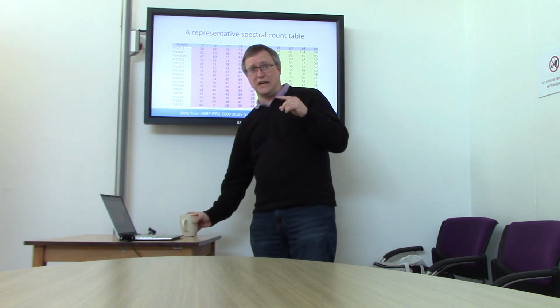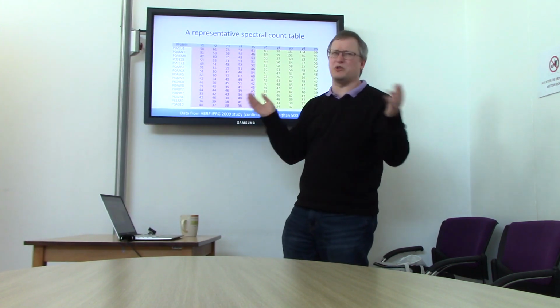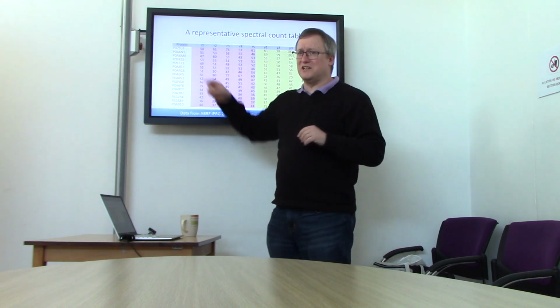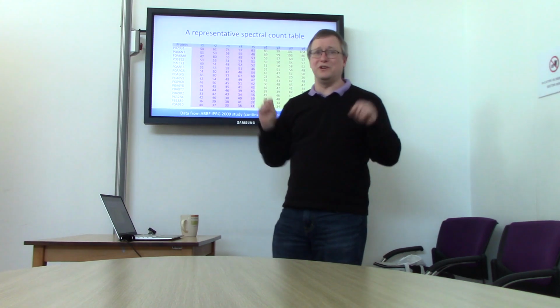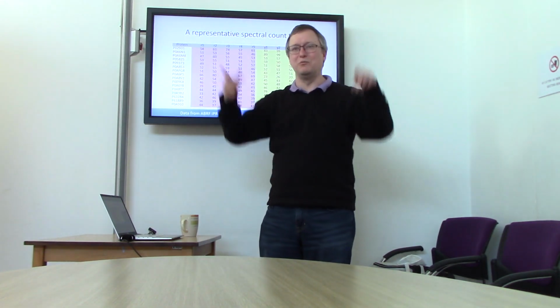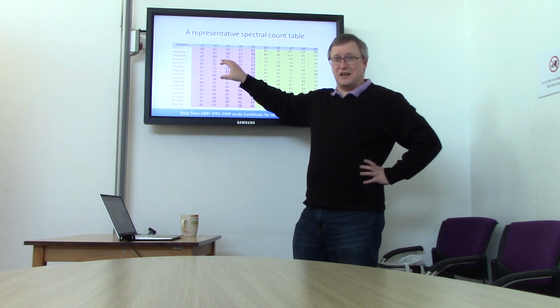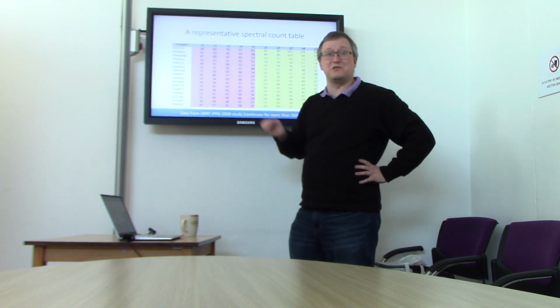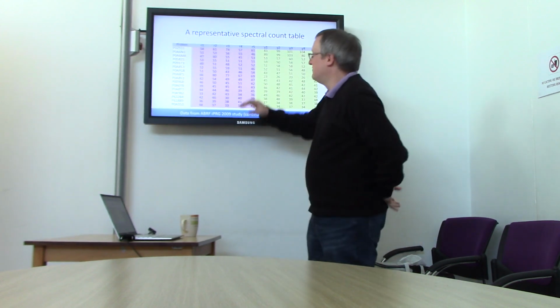These are, by the way, real data. This is an experiment we did back in 2009 on an Orbitrap Velos. We had 5 experiments that represented red E. coli, and we had 5 experiments that were yellow E. coli. We're just calling them red and yellow because those were the colors we outlined them with on our gel in the end. But we know that a subset of these E. coli proteomes are differential because we cut those proteins literally out of the gel. So we know that they're gone, mostly.